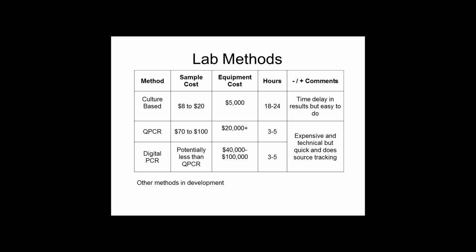You can have those analyzed individually and then take a geometric mean. But another option that we're looking at right now and allowing is that you would take your left, center, right, all 3 samples, build a composite, and then run the analysis on that. And we can talk more about that later if you want to, say, well, you're not exactly doing the same thing. Yes, we get that. But there's some circumstances that we can do this, and it makes sense. The results will be very accurate and consistent.